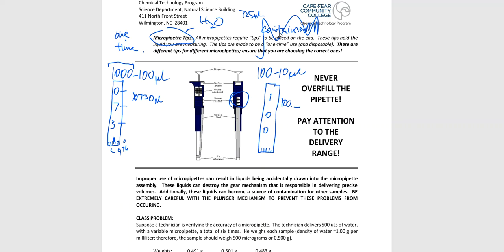That is not an issue at all. All right, well, if I choose that smaller micropipetter where we only have to worry with 3 digits, and that is it, if I do 050, then that is sure enough 50 microliters for that particular micropipette.